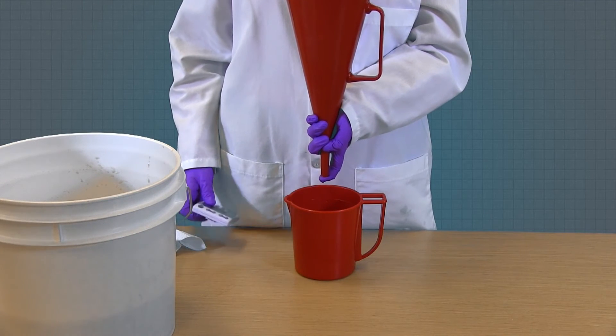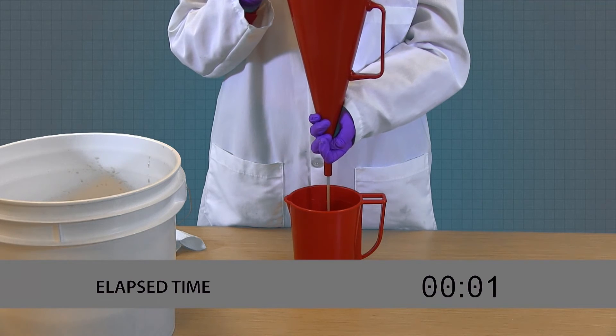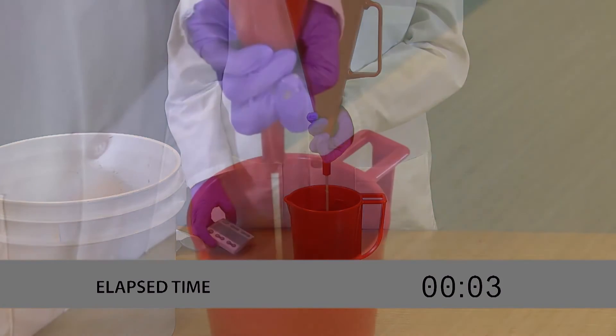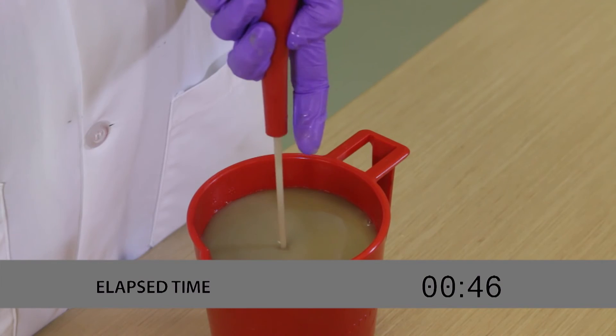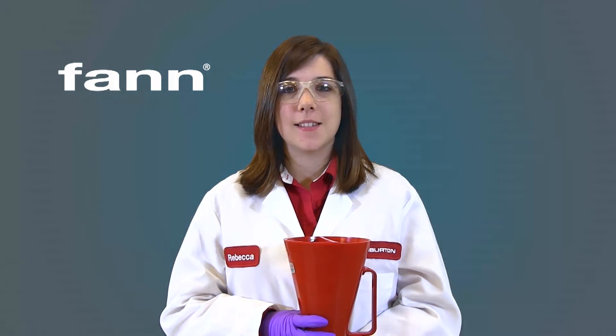Now we'll use a stopwatch to time how many seconds it takes for the fluid to flow out of the funnel to the one-quart line in the measuring cup. In this case, our fluid's viscosity was 47 seconds per quart. That's how easy it is to use a Marsh Funnel to test a fluid's viscosity.